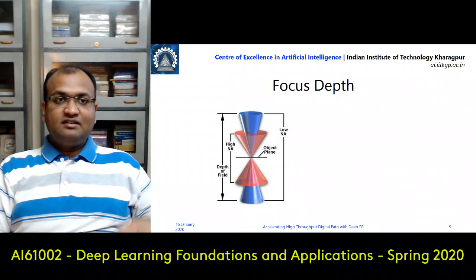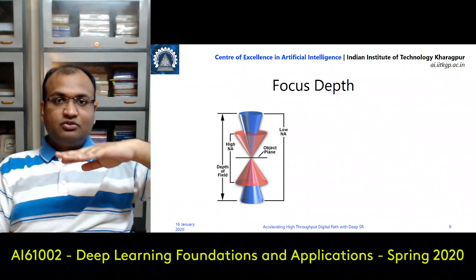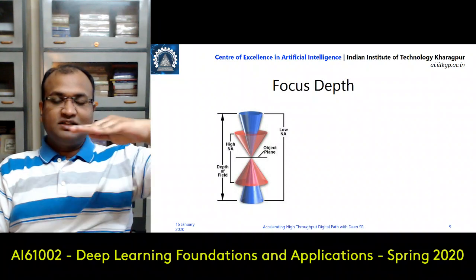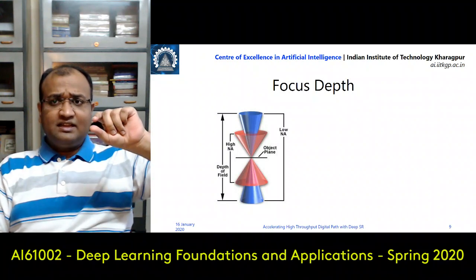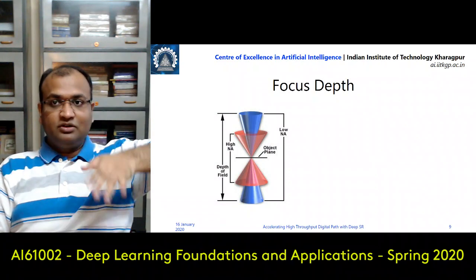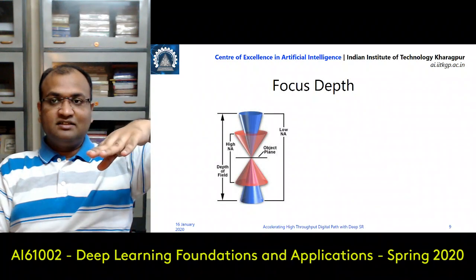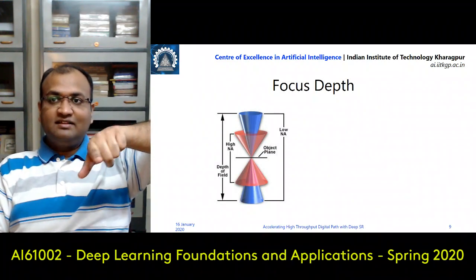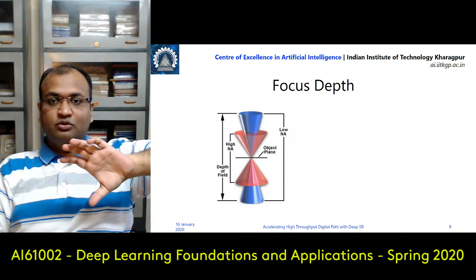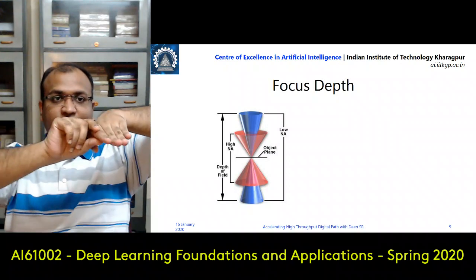What I said is that I am slicing tissues into much thinner layers. Now, it's a layer, but that does not mean it has zero dimension in the z axis. If my plane exists in the xy axis, then it would have zero thickness in the z axis, delta z equal to 0. But for a physical system that is never so. There is a thickness which you will be able to see.